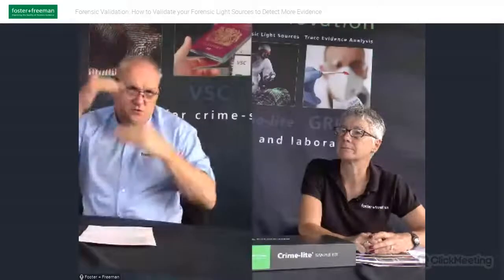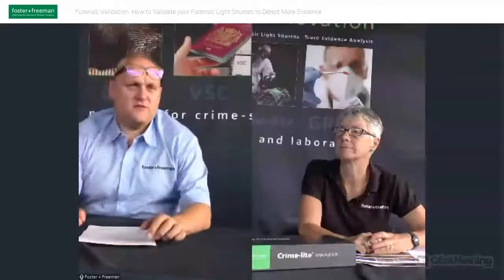Yeah, I'll take this one. There's sort of two questions that are mixed together. The first one is, when we use the Crime-lite Auto, which goggles do we use? And also, if we use the Crime-lite Auto, does the light not affect the eyes, or is there goggles?